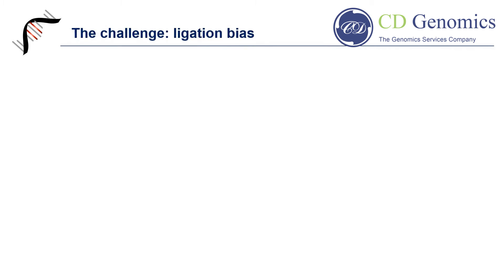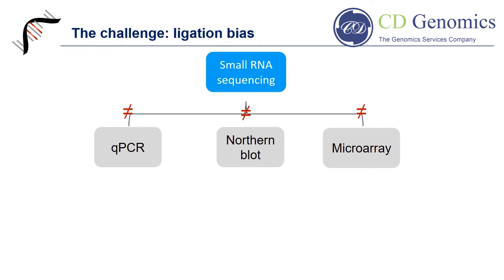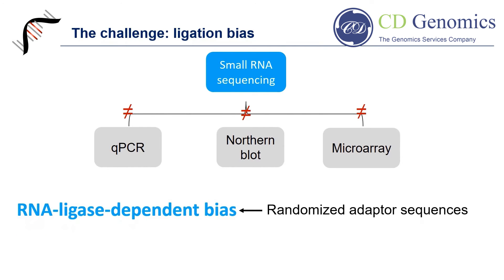Researchers have gradually found that sequencing data containing differential expression of small RNAs is sometimes inconsistent with microarray, qPCR, and northern blot results. This has been primarily attributed to the RNA ligase-dependent bias for particular adapter sequences, introduced during small RNA library construction. Studies have suggested that randomizing the adapter sequences close to the ligation junction can reduce ligation bias and optimize sequencing results.